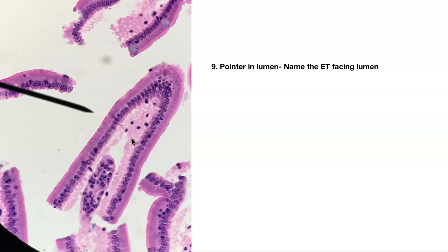Number nine. What is the epithelium facing the lumen? Pointer is in the lumen. The basement membrane is somewhere down here — this is all connective tissue. This is simple columnar. The nuclei are towards the basement membrane. Simple columnar.